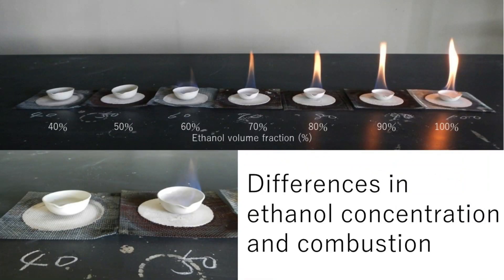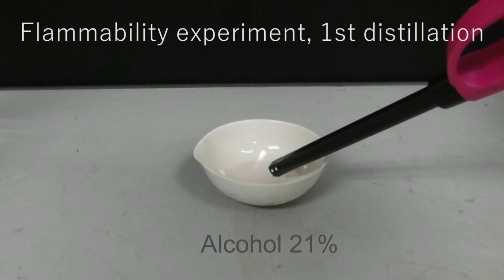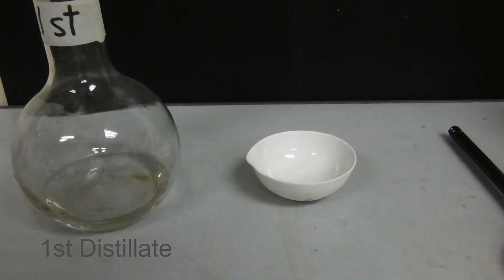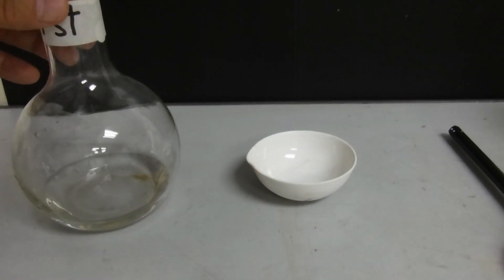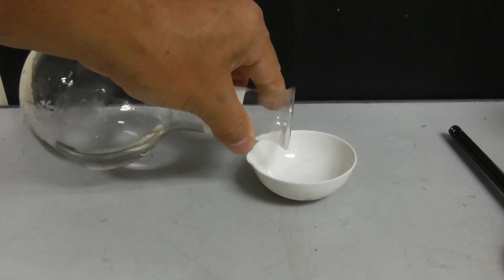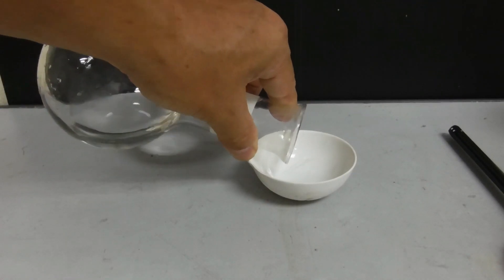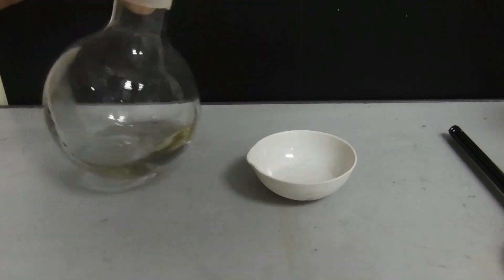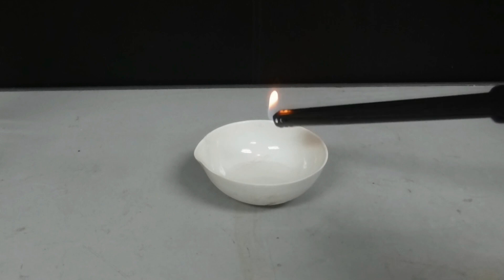The picture shows the ethanol concentration at which the solution burns. Let's ignite the first distilled solution. Ethanol solution does not burn unless it exceeds 40%, so it did not catch fire.